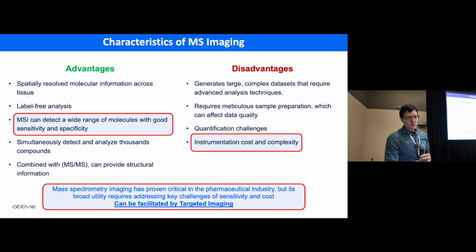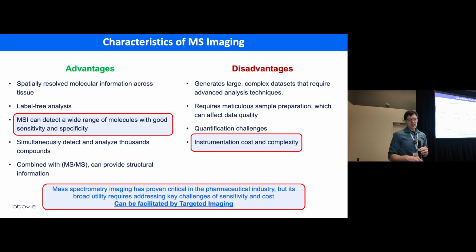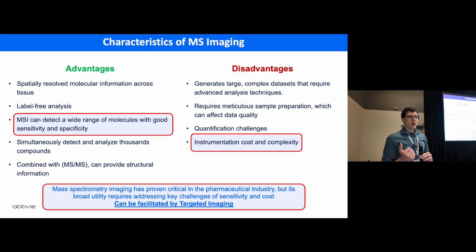So because, for the kinds of studies I'm doing, we are mostly interested in sensitivity and specificity, I'm looking for my drug of interest. And because I have to do this a lot and I don't necessarily want my instrument to be big and complex, moving from a broad spectrum analysis to a targeted analysis allows me to move to instruments that are less complex, less costly, but are more sensitive.